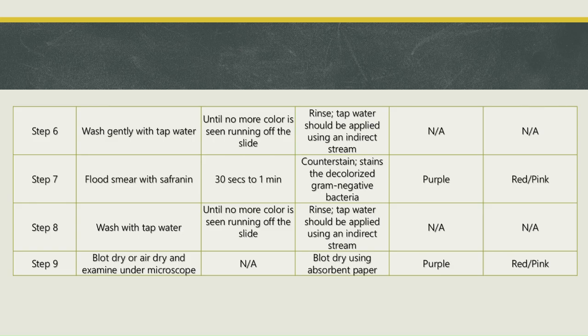Step 7. Reagent/action, flood smear with safranin. Time, 30 seconds to 1 minute. Function, counterstain, stains the decolorized gram-negative bacteria. Appearance of gram-positive bacteria, purple. Appearance of gram-negative bacteria, red/pink.